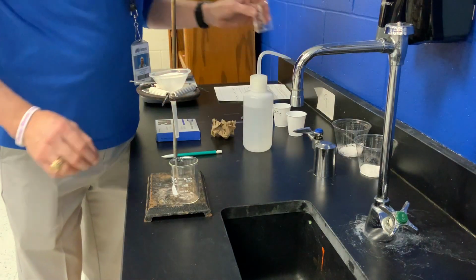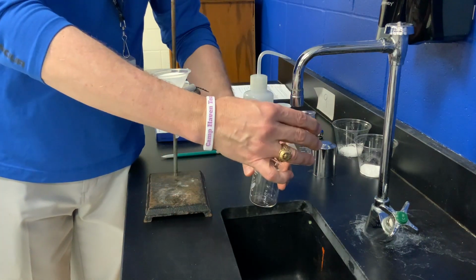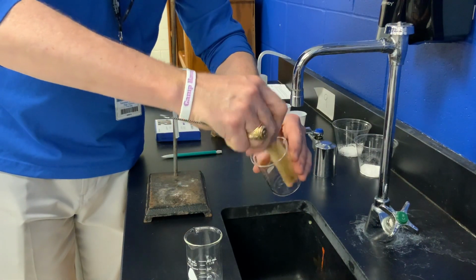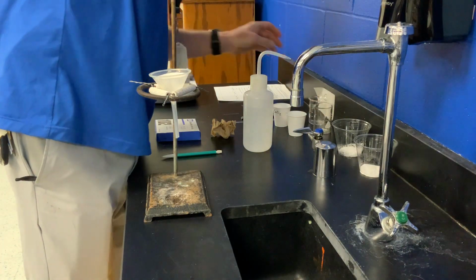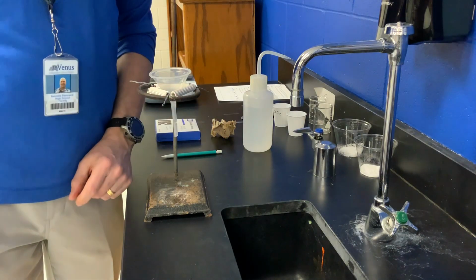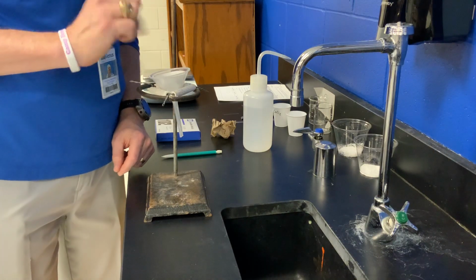At the end, you will take both beakers, you will rinse them with tap water, and you will use a brush to clean the one that had the solid in it. Put them aside. You'll take your filter paper. Don't worry, there's nothing in there that's toxic. And you will put it wherever your teacher has told you to put it so that it will be ready for day 2.